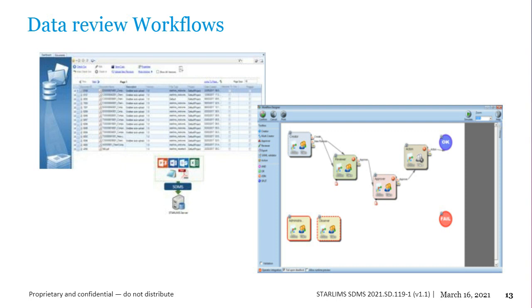And all of these documents that are already in the SDMS database can be checked in, edited, and then checked out, and edited, and then checked back in. So really similar to a DMS. All the traceability related to that document workflow can be found within the workflow history application. It displays all the records of the performed actions, for example, when it was created, who reviewed it, all the different stages. Any rejections or approvals of your instrument data is also within the standalone SDMS.